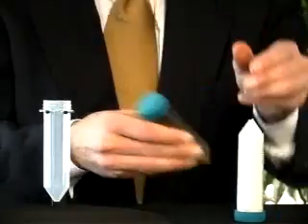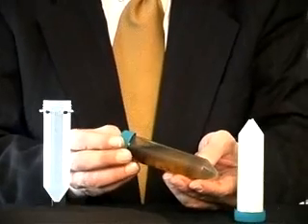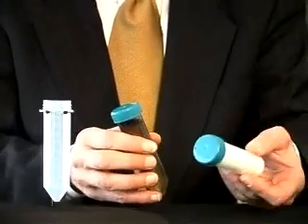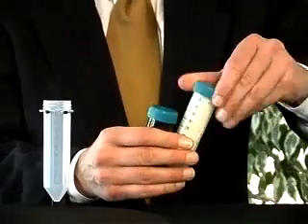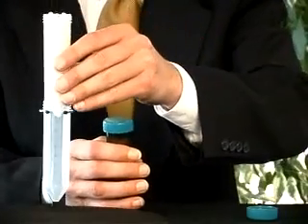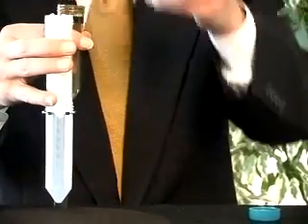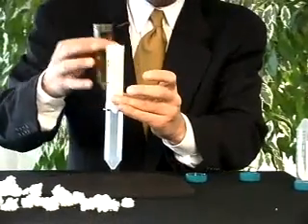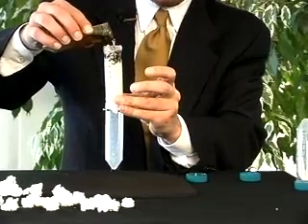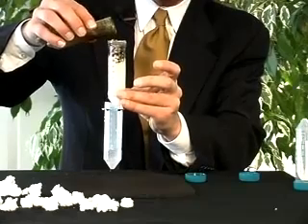We'll now shake it up so that it's thoroughly mixed. With that, I will take the Smart Sponge, which has been placed in a tube for this demonstration. And I'll take the dirty, contaminated water and simply pass it through the filter, in which you can see how quickly it removes the contaminants from the water.